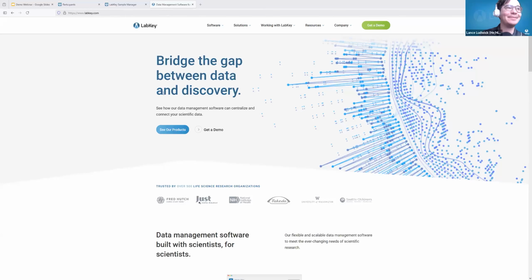All of the data is there forever, so long as you keep up your contract. Should you end your contract with us, we will export that data and send it to you. We don't hold it hostage.